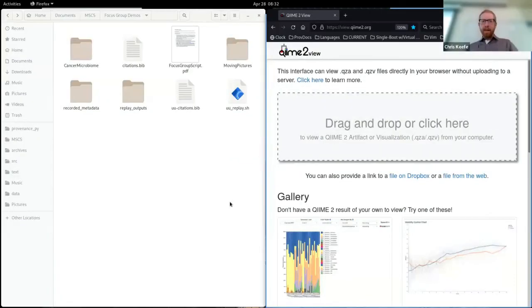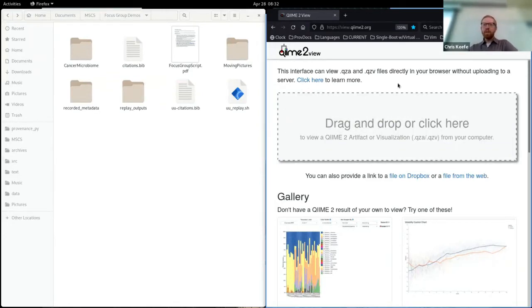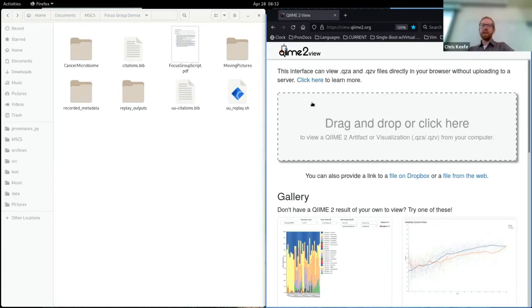All right, here we go. So can everybody see on their screen QIIME 2 view on the right, and I've got one thumbs up so I think we're in good shape. So on the right side of your screen you see Q2 view. This is that tool that I showed you earlier for viewing QIIME 2 results.